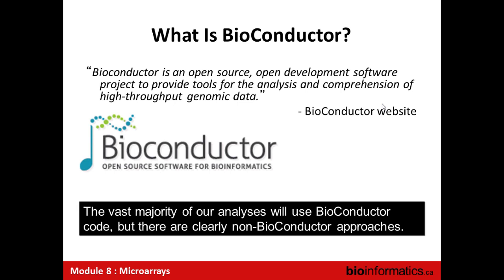And I often, at this point in time, tell a quick story about commercial software for analyzing microarray data. One of the most common algorithms for analyzing Affymetrix data is called RMA. We'll talk about it in a few seconds. RMA was initially implemented in Bioconductor, in R, and a bug was found a few months after it was first released, and so they changed it. At the same time, a commercial software package, which I'll leave nameless, said, oh, this is the new standard, so we implemented it. It took them over 4 years to fix the bug in the commercial software package that was fixed in R within a month.